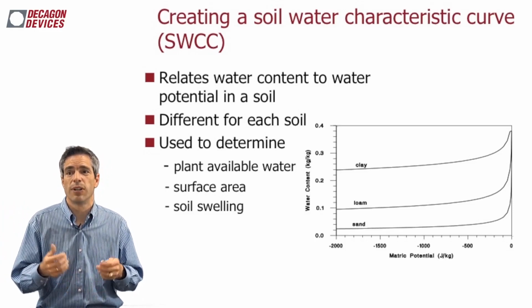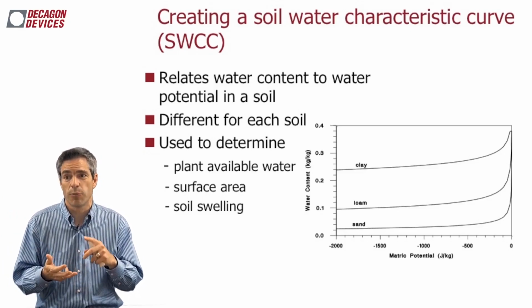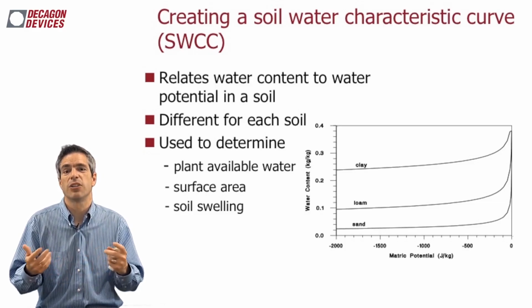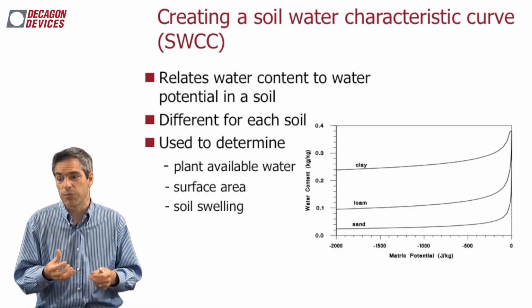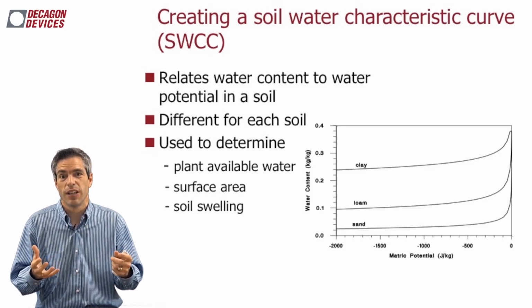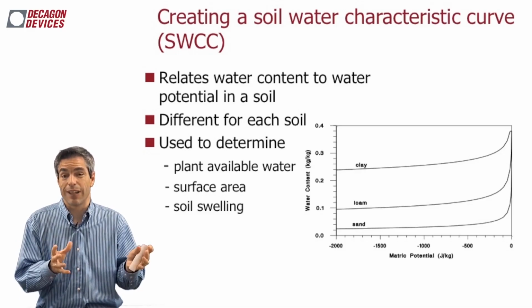Now we're going to go through these determinations in a little bit of detail, things like plant available water, surface area determination, and finally looking at swelling soils, which may not be even your area of study. But to me, when I learned more about that determination and what you need to learn about that, I was really excited, because I lived down in Texas for quite a while.